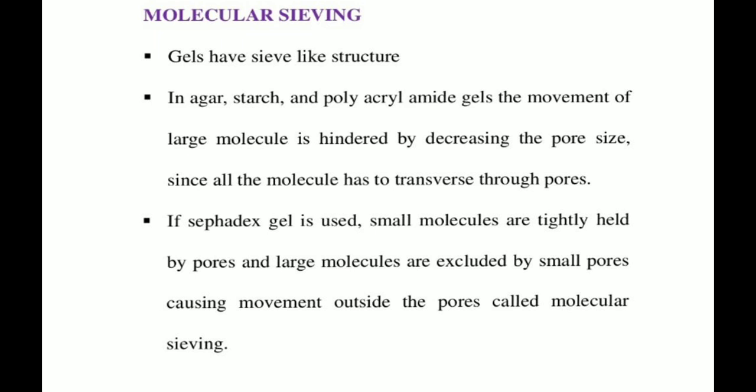So this is all about electrophoresis, and we discussed different factors that affect the electrophoresis process, okay. So I hope you guys understand what is actually electrophoresis, and which factors can affect the electrophoresis process. Okay, thank you.